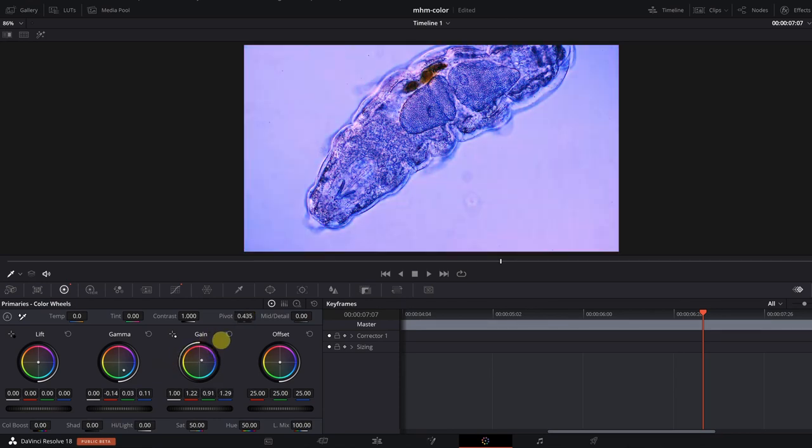There are different ways you can adjust this, and I think the best way is to simply experiment around a little bit until you get a result that you're happy with.